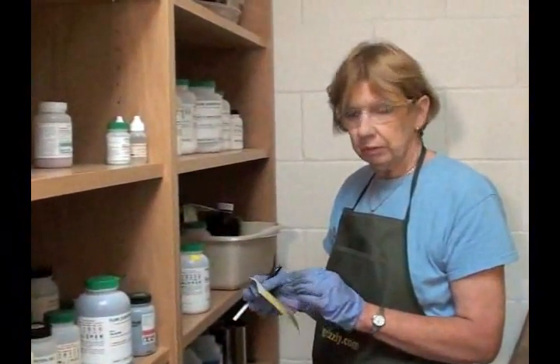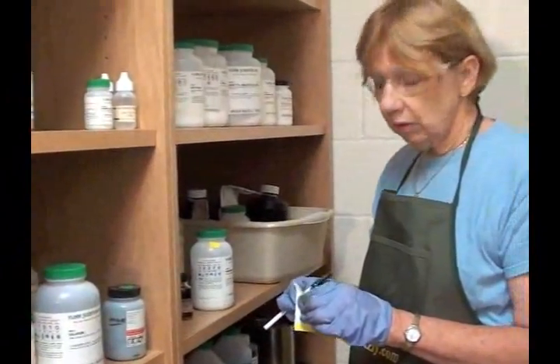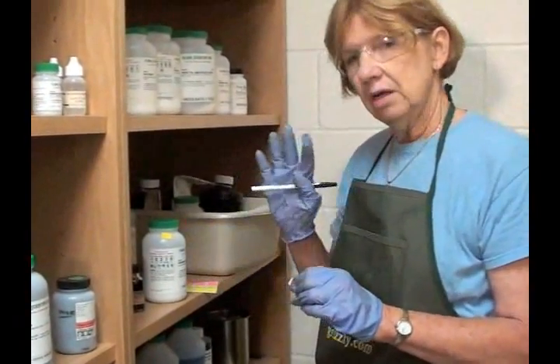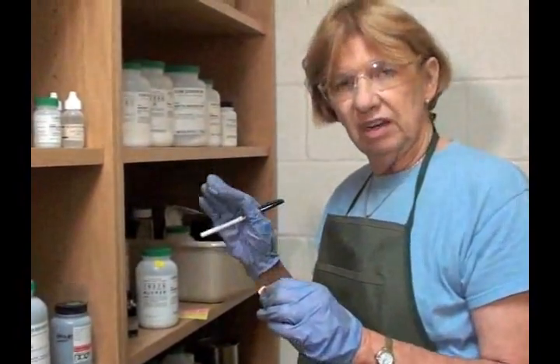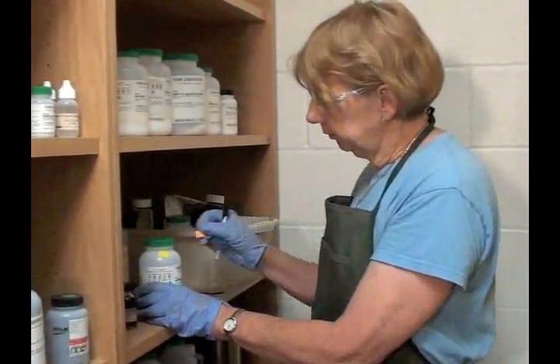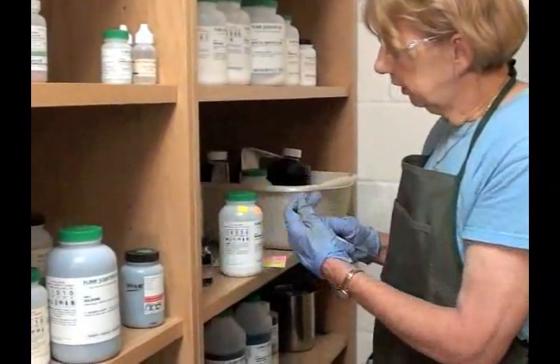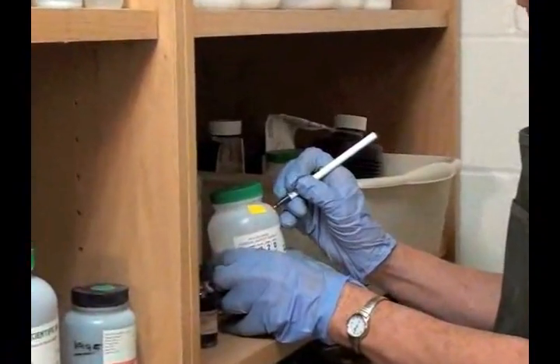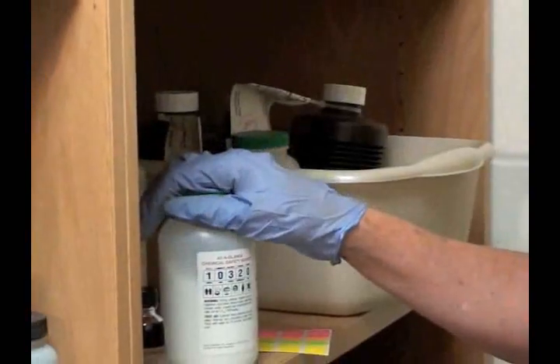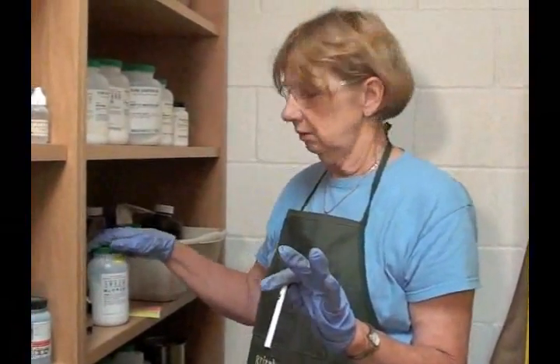Another useful trick when you are putting these little stickers on the containers of the material is that if you know this material is a regulated hazardous waste, and you can find that out by looking at EPA's website. They have a list of materials that are hazardous waste, either because of their characteristic or because they're listed. So they have two categories, characteristic waste and listed waste. This would be a characteristic waste because it is a strong oxidizer. So I would put a little sticker on there and just write HW or something of that sort, so that when it comes to the time to dispose of it you know that this is a regulated waste and you can't dispose of it in the trash. You can't put it down the drain. It has to be handled as a hazardous waste.